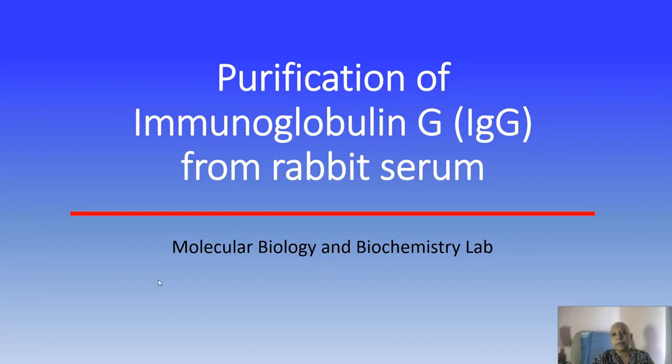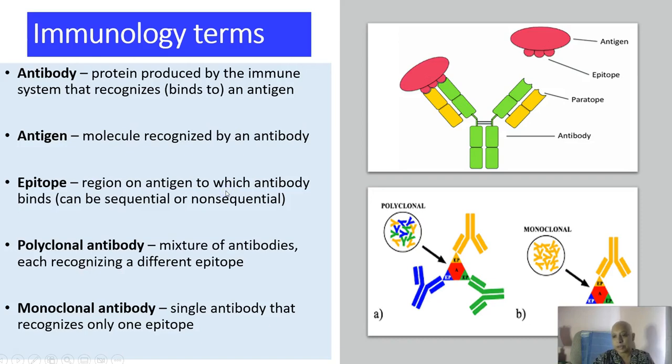Okay, so today we are going to be talking about purification of immunoglobulin from rabbit serum in order to practice some affinity chromatography techniques. So let's first talk about some immunology terms.